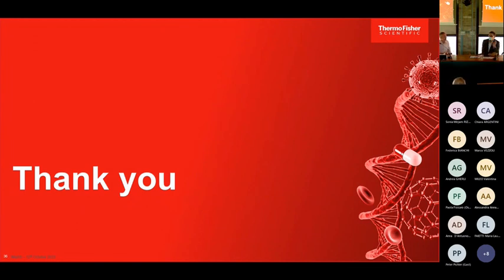Thank you very much for your talk, for being here today, and it was very exciting, plenty of data. Just a note, this field is clearly led by Orbitrap technology. That's a fact, no question about that. Just to mention that we will also have speakers today showing what the TOF technology is doing in this field. Absolutely. You need to investigate everything, every option. Some options are better for some things. The way I always say it is like you buy a car. If you want to just go to the shops, maybe you don't buy a Ferrari. You have to buy the right tool for the job you're doing.